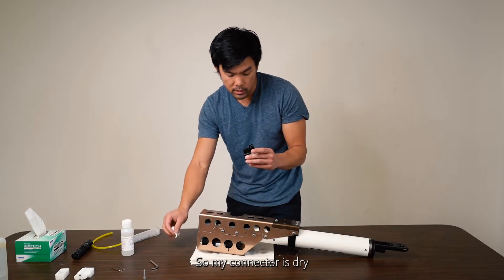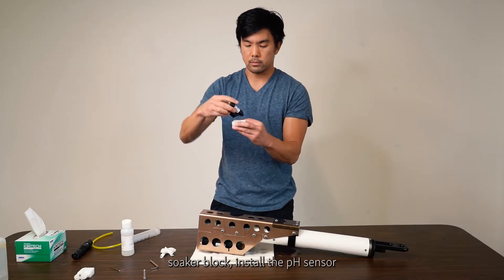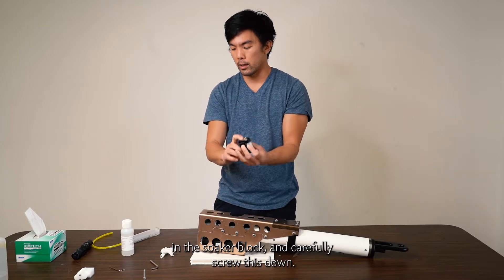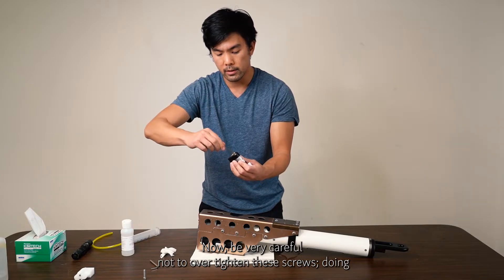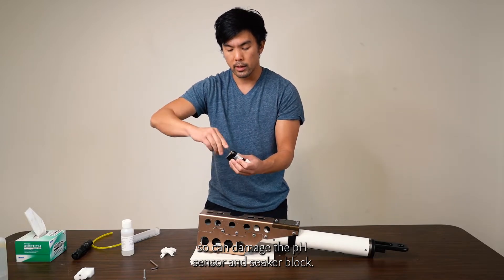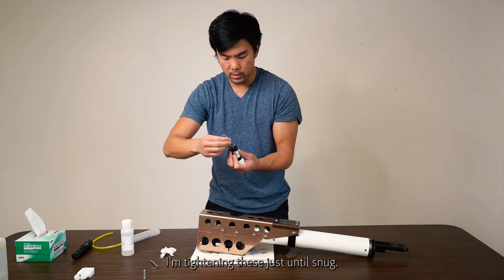My connector is dry. Now I'm going to take the pH soaker block, install the pH sensor in the soaker block, and carefully screw it down. Be very careful not to over-tighten these screws — doing so can damage the pH sensor and the soaker block. Tighten only until snug.